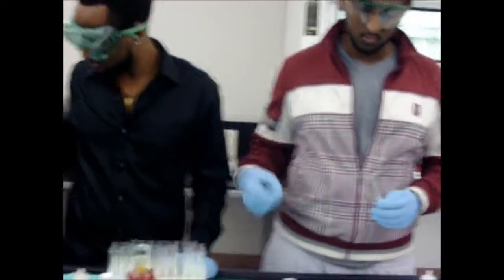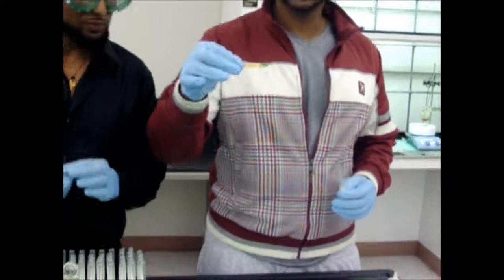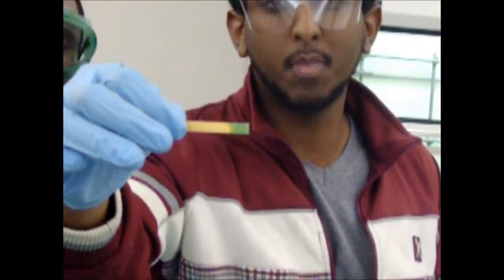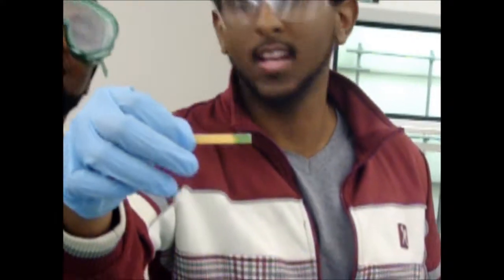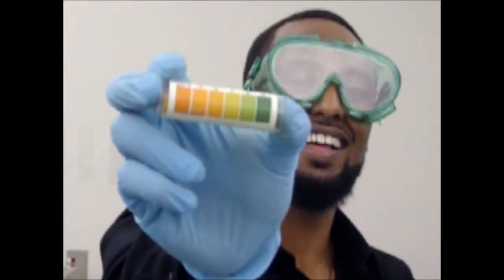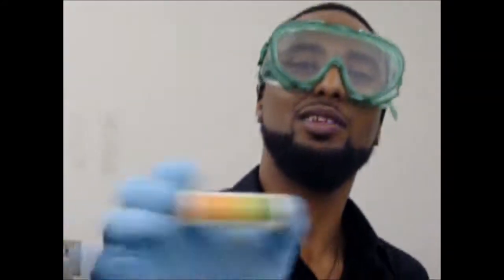So as you can see, the color is closer to neutral. So it's about roughly 7 or 8. Show that up for me one more time. And that's 8. So it's around 8, which is a good indication that we do have nitrogen in our compound.